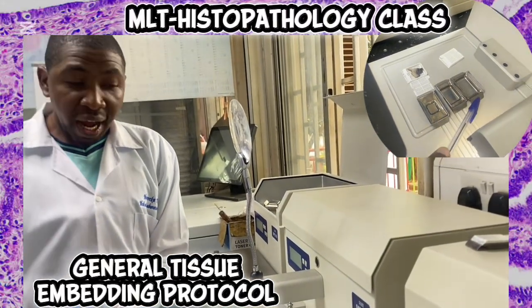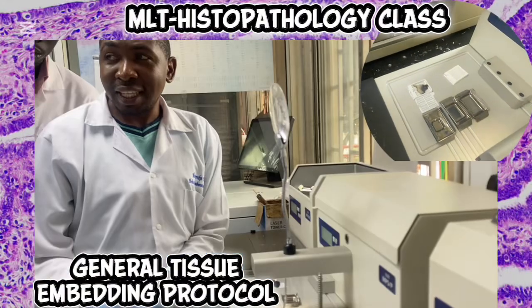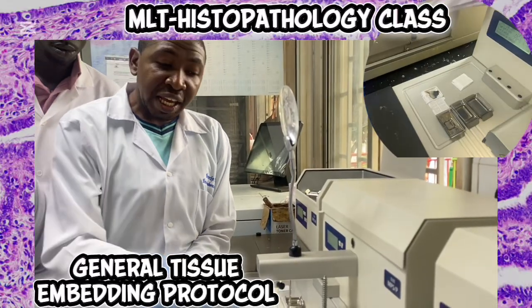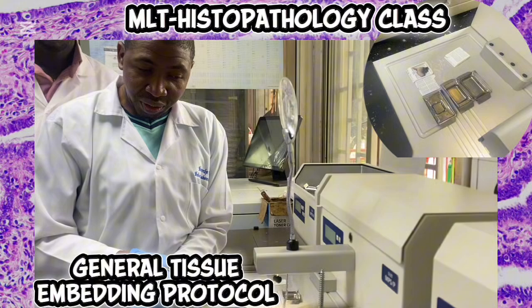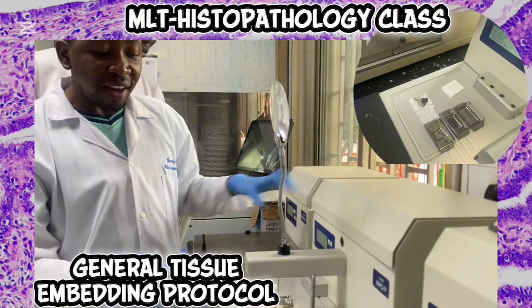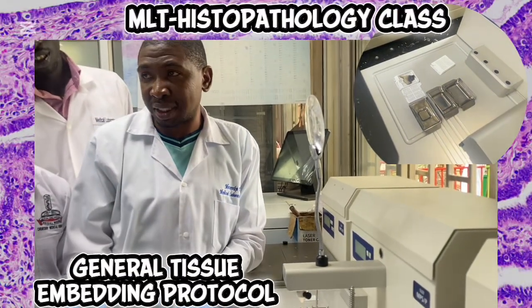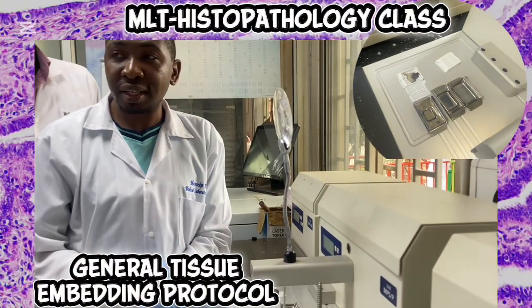Why? If you get this tissue and put it in this mold, what will happen? It will protrude on the side, okay? Literally, you're going to fold this tissue. Even orientation will not take place as required, okay? The same, it doesn't make sense having a small piece of tissue, then you use a bigger mold. That is the wastage. We may be having bigger tissues that will require this mold.